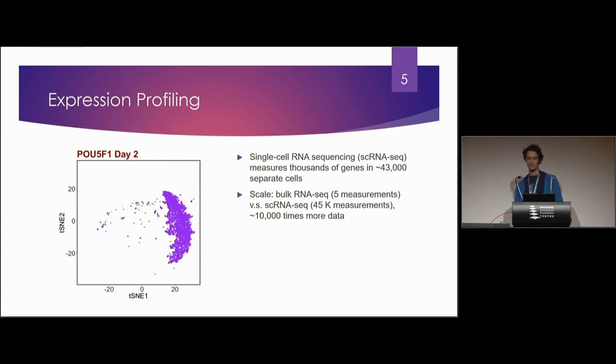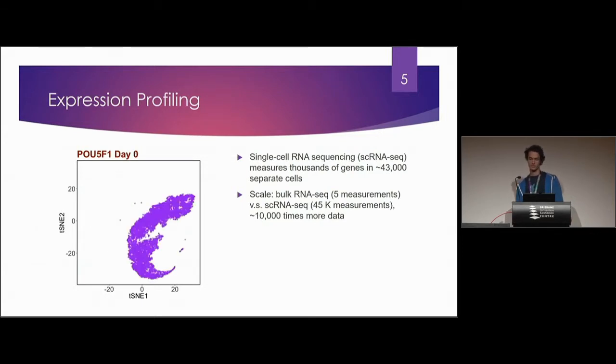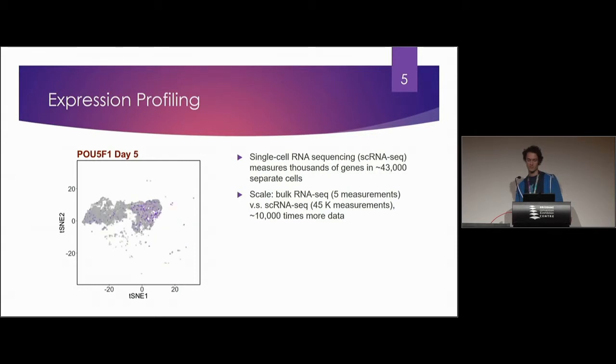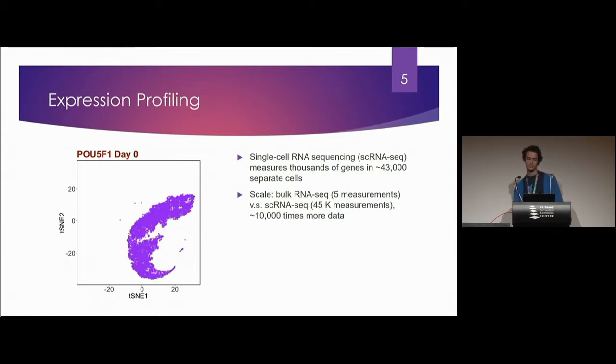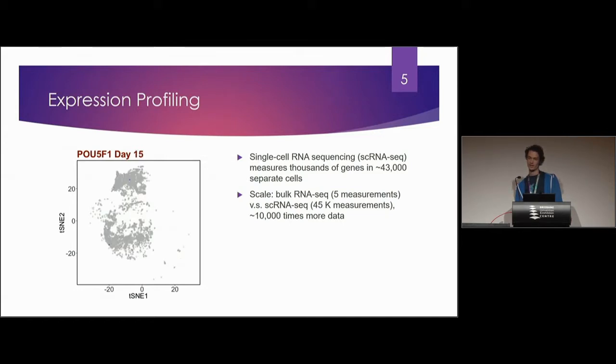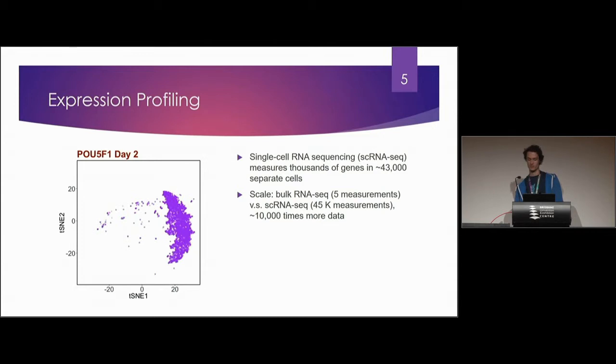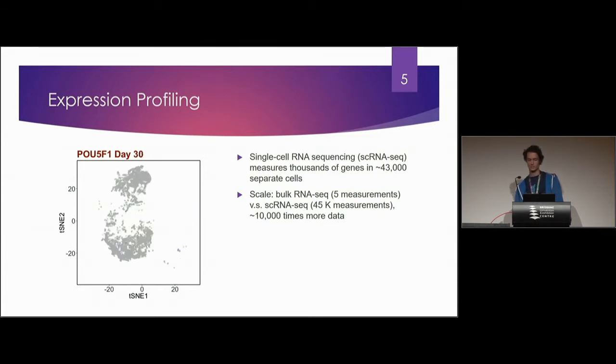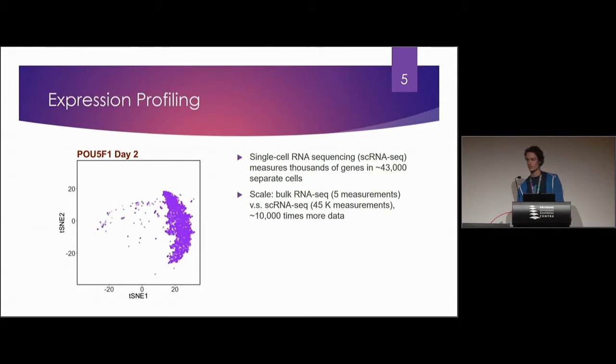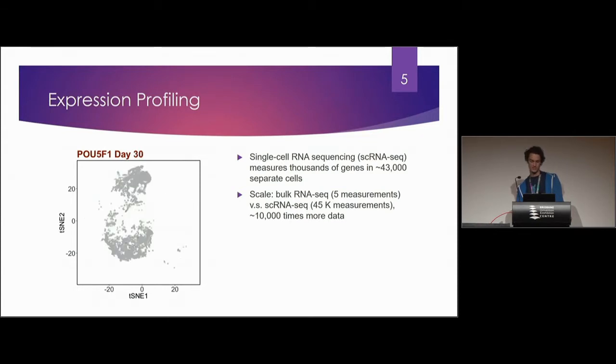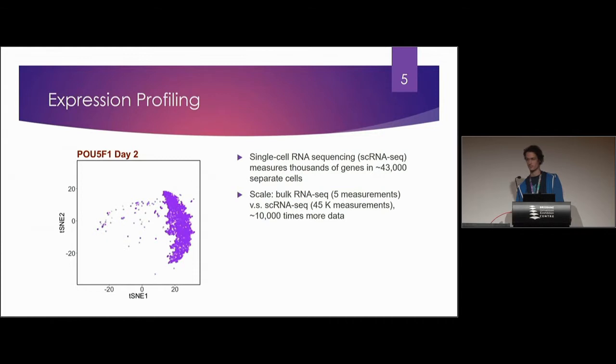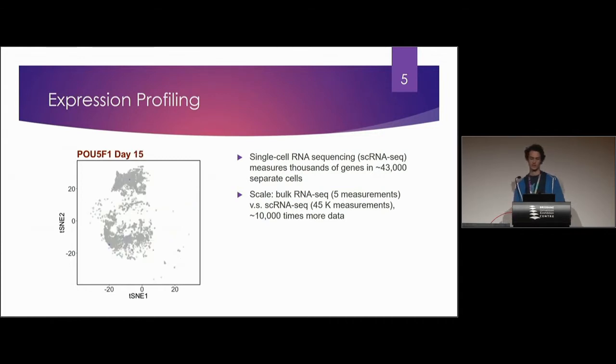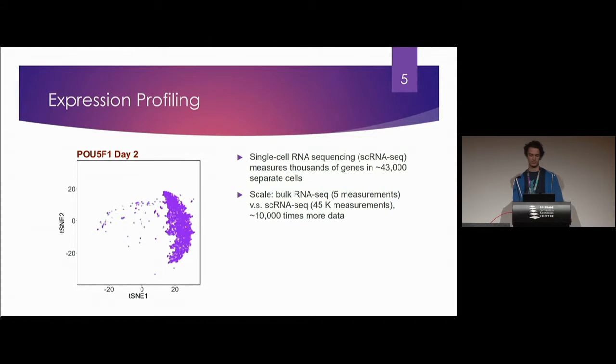Expression profiling is a pretty important part of the single cell sequencing process. What you can see here is 43,000 cells over five days where each day they've had their expression profiled. You can see the gene that's being presented is POU5F1 which you can see is highly expressed in days zero and then gradually becomes less and less expressed going forward.